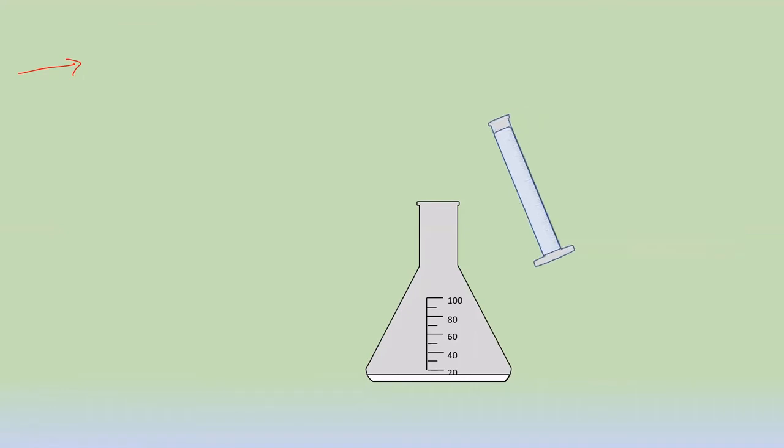Now you will pour that 10 ml of 10% aqueous solution into the conical flask and mix the solution. As you mix the solution, you will find some kind of white solid generation taking place. To some extent, salt formation takes place during this addition itself. And therefore, you can see some white solid will be formed in the reaction.